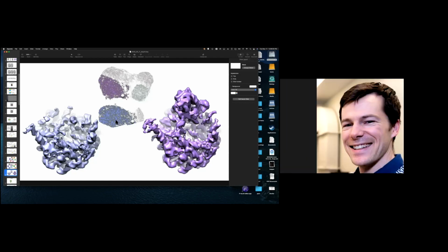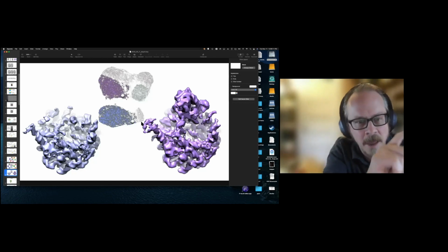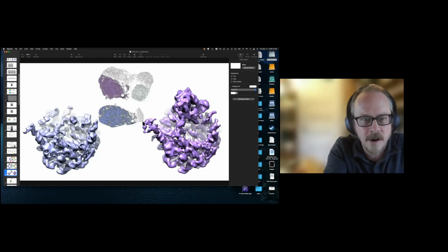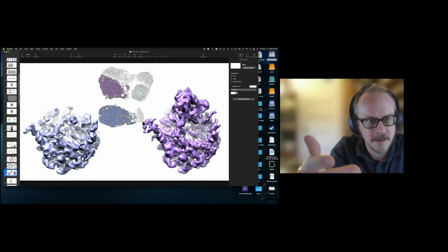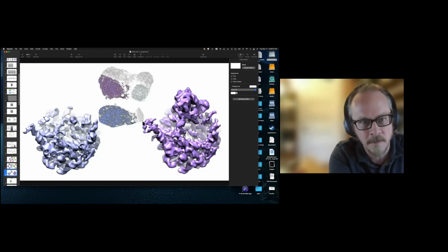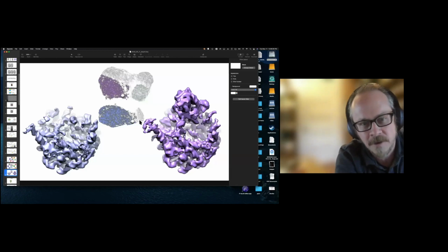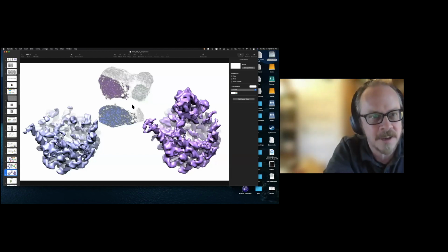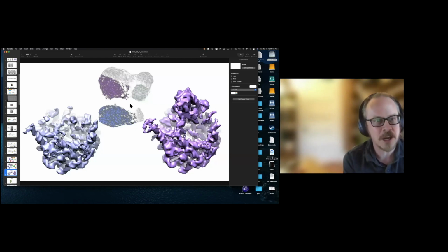Okay, thanks. Yeah. So I had a related question, so I'll just jump in here since you've got the slide up. The thing that jumped out at me is that if you think about these as conformational landscapes, these white areas are huge barriers, right? And some conformations have low barriers, like between the purple and the one above it. It can sort of jump between them. Have you looked at the top, which has a little land bridge that connects it to the next one, and what those interchange points almost are, right?